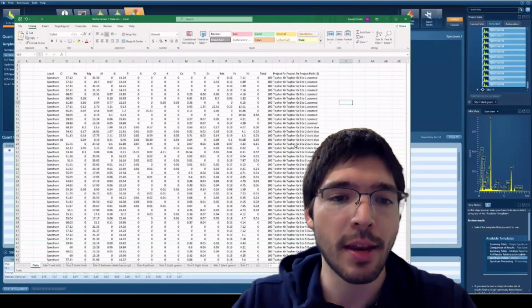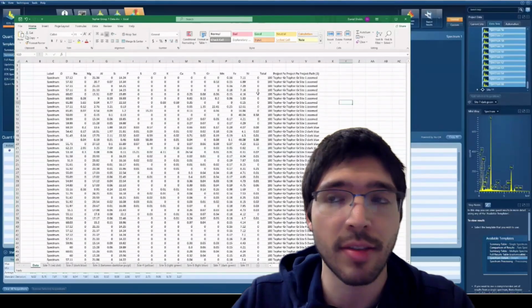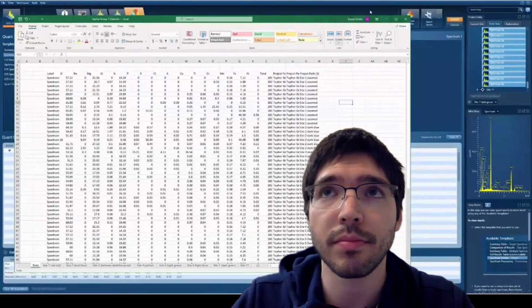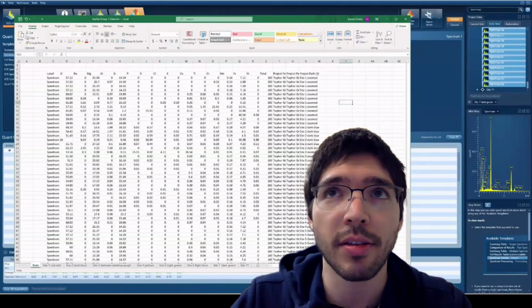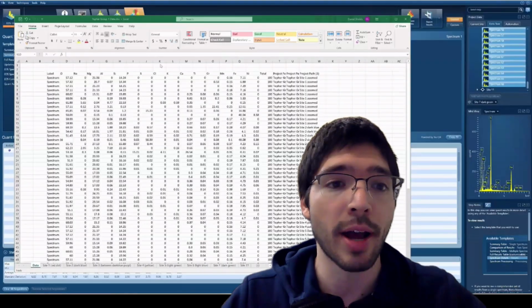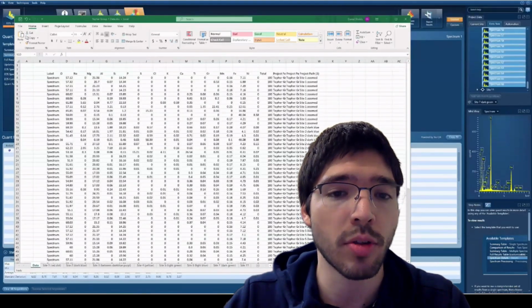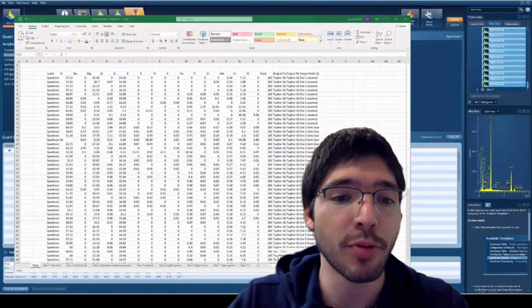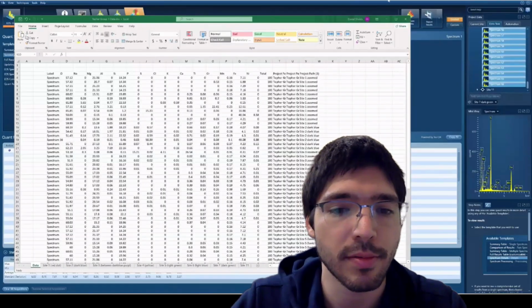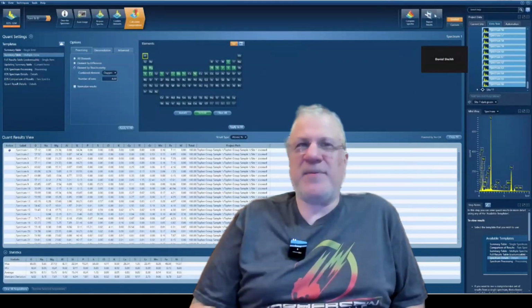And so, I think we went for maybe 3 hours and we got 60 sites. That's pretty good. In some cases, even within an hour, I can get about 40 to 50 sites, which is a lot faster than if you're using a microprobe. So you get more data out of it at the end of the day. God, you'd be sitting there just twiddling your thumbs for a couple hours waiting for the reading.